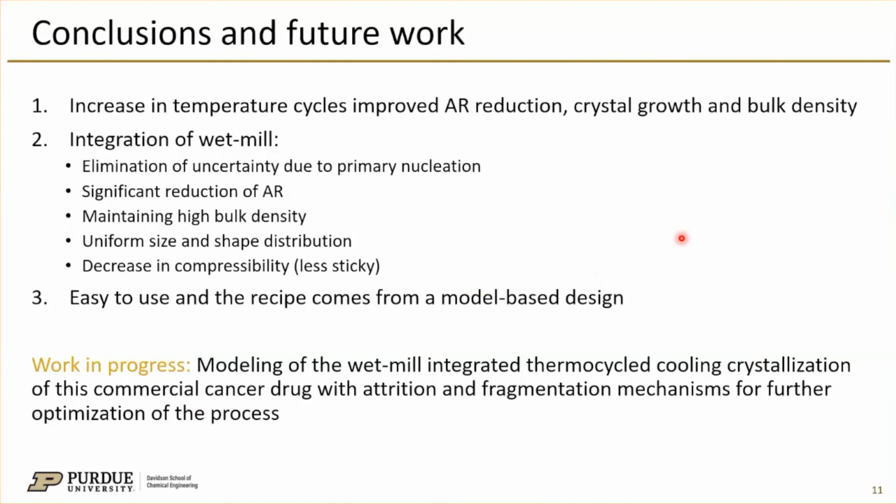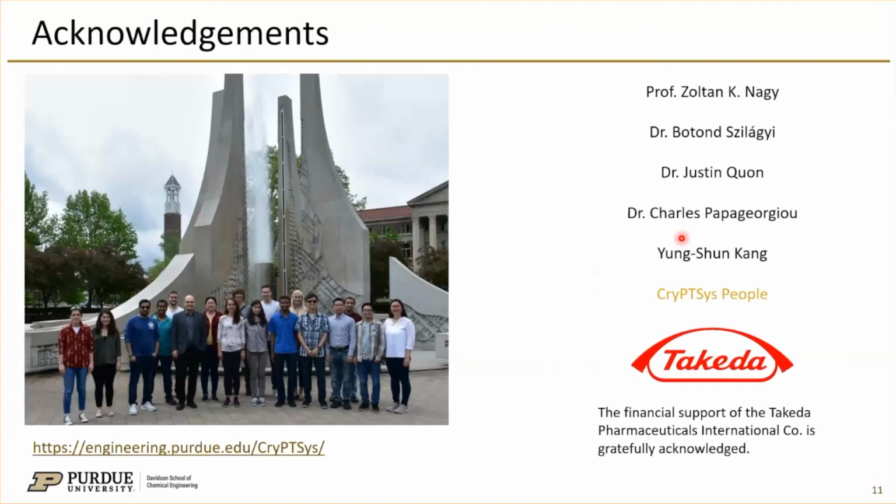As our future work, we want to investigate more on optimization of wet mill usage during thermocycled experiments. For this purpose, we already started the parameter estimation calculations of the model of the system by using the experimental data shown in this presentation.